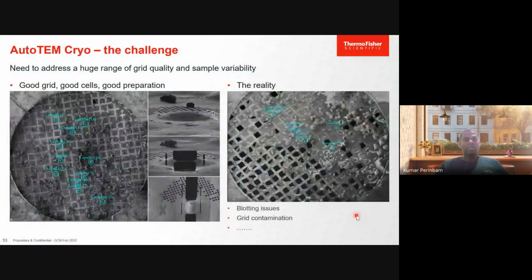So how this is being done is you grow the cells on a copper grid, and then you identify a good region of the tissue. The holes you will just ignore, but those places where the tissue sample is quite intact, you cut off with a plasma beam.